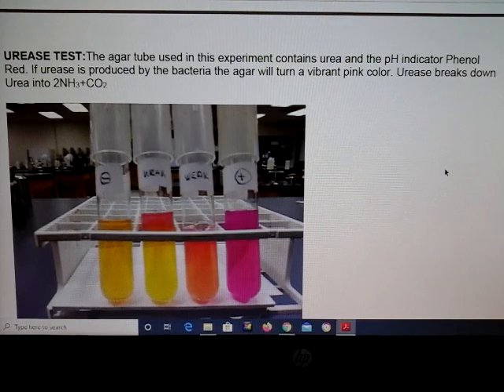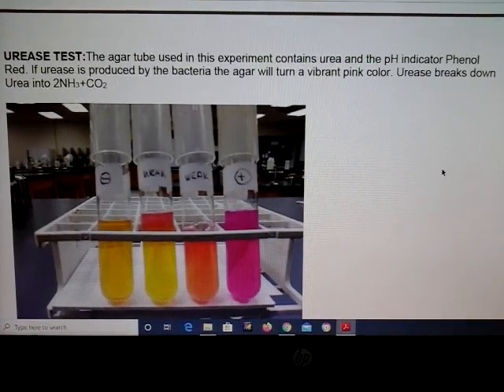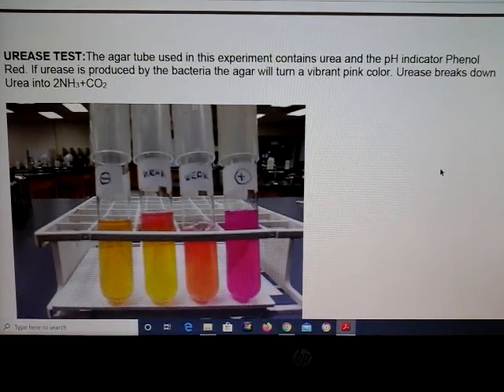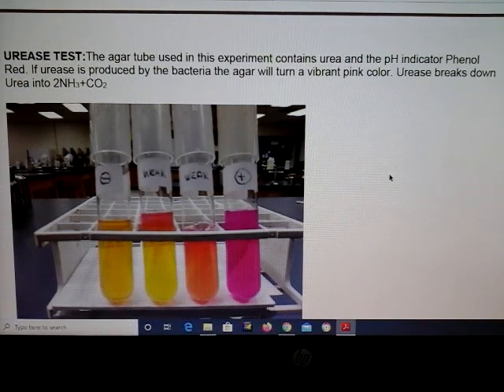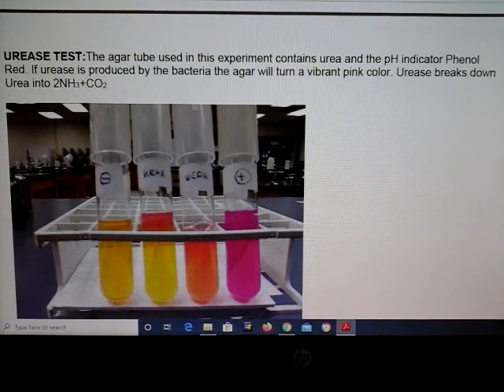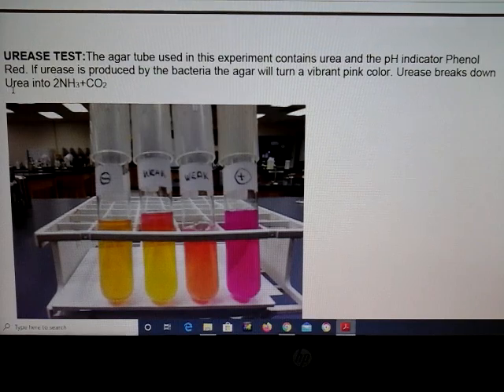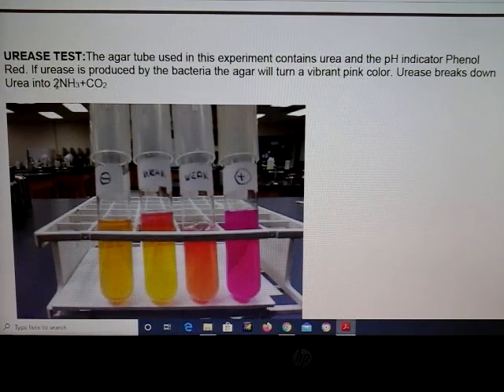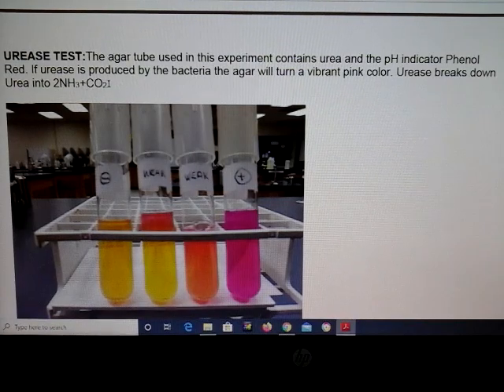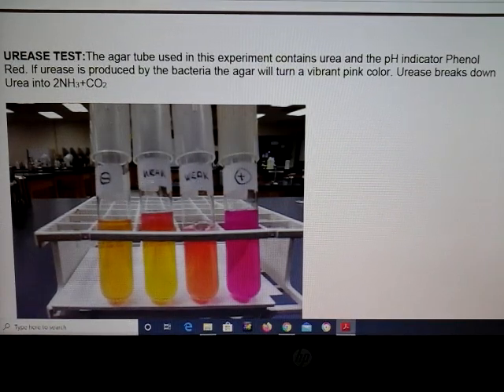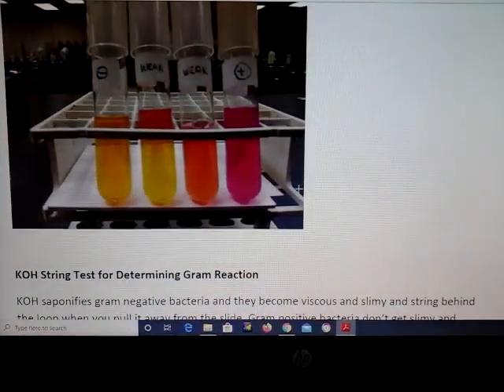The urease test is another one you can do to test your bacteria. The media contains phenol red, which at an alkaline pH turns a vibrant pink, as you can see here. The reaction that takes place is that urea will be broken down into ammonia, which raises the pH, plus CO2. You can also see what weak reactions look like here as well.